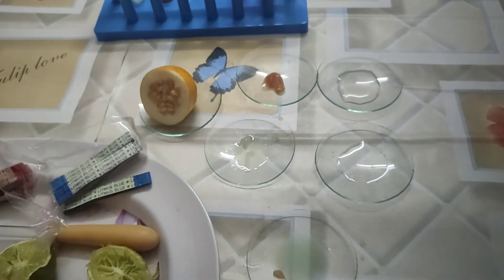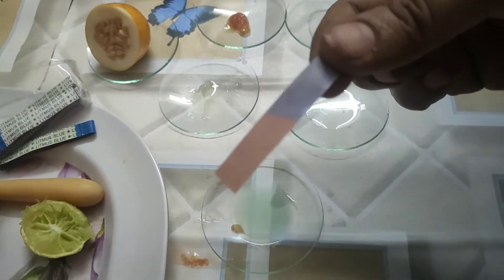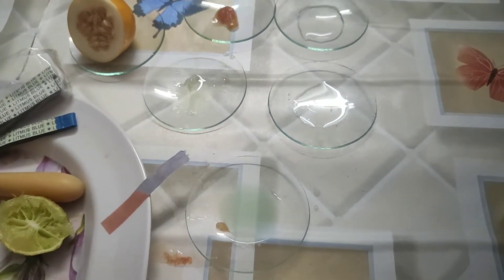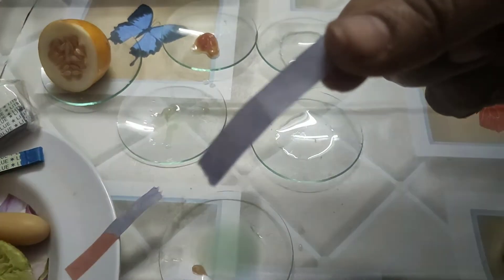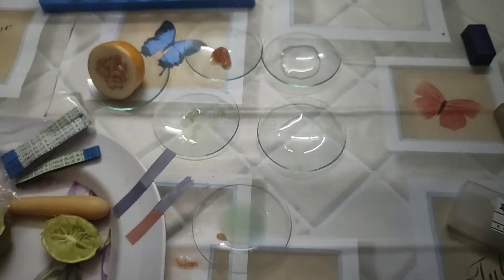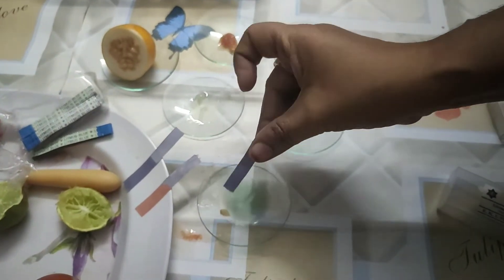That red color means the substance contains acid, because blue litmus changes to red only in acidic substances. Now dipping in the next substance — the blue litmus paper does not change to any color, which means that substance is a basic substance.